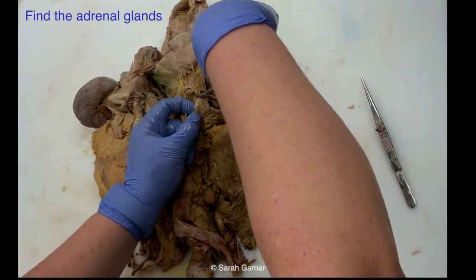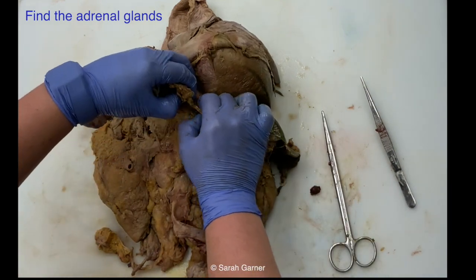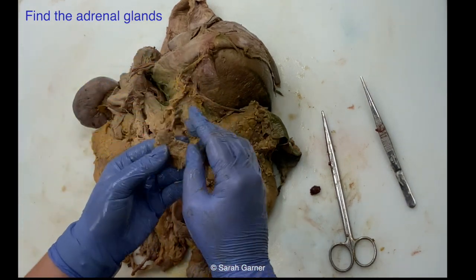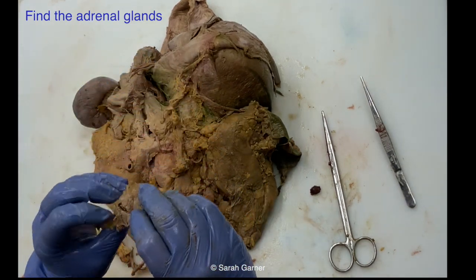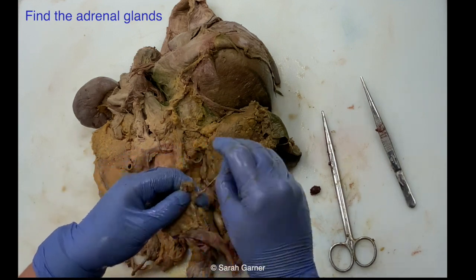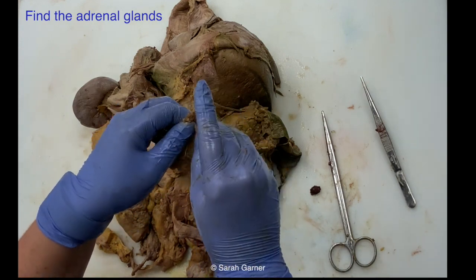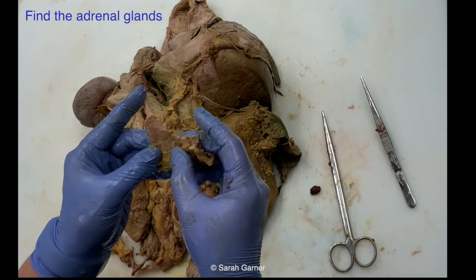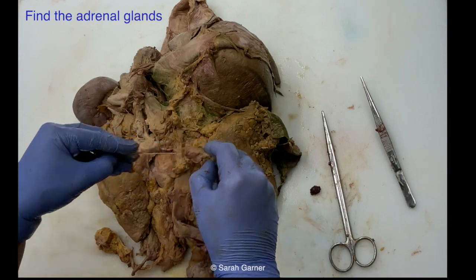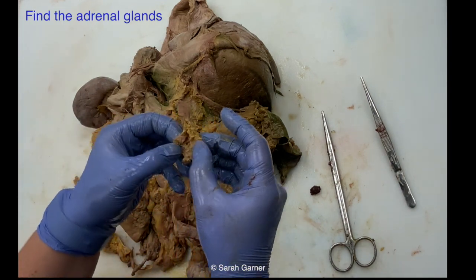Pretty much all organs at autopsy you're going to weigh. So once you get it out, you're going to make sure all your fat is trimmed off, because you don't want to be weighing excess fat, and then you'll be able to weigh it. Here I can feel the outline, and I can even see the outline, so I'm just picking off the fat on the outer part. You could take blunt scissors and do that. Same thing down here. This is just excess fat. Now, you don't want to get too crazy and try to peel off too much, because then you might accidentally open it like I just did.